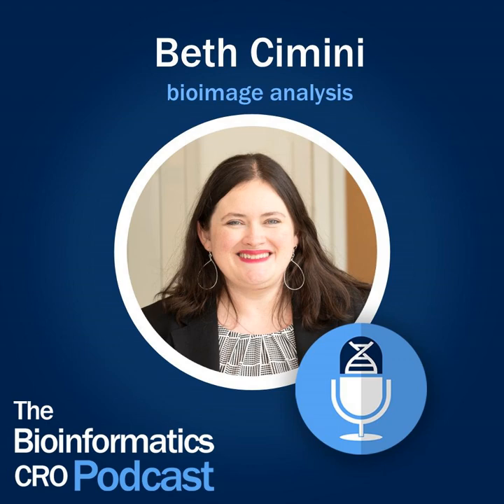But when we get to bioimage analysis, we're trying to look directly at the cell object or nuclear object or worm or whatever object you might care about. And the phenotypic changes that are usually exactly what we want to detect are going to affect our ability to find that object potentially. If we have a very finely tuned object detector or segmenter to find cells, and we've told it cells are between 10 and 15 microns in diameter, if we have cool biology that causes the cells to be 17, our algorithm might just stop detecting the cell altogether. And so we will miss that cool biology because it has gone outside the definition of what a cell is.